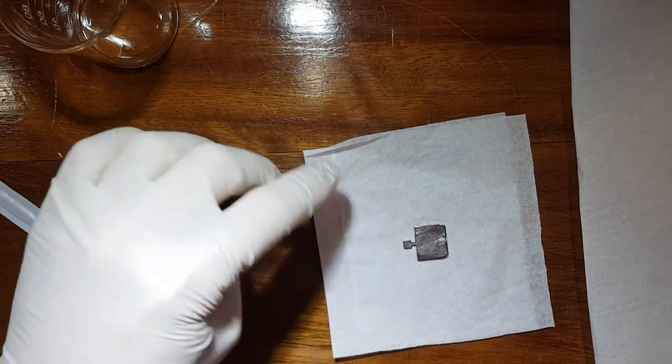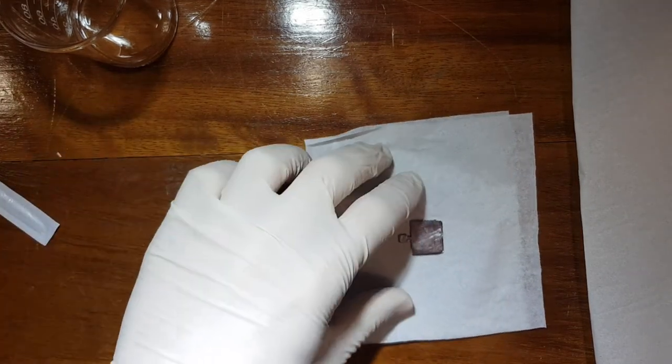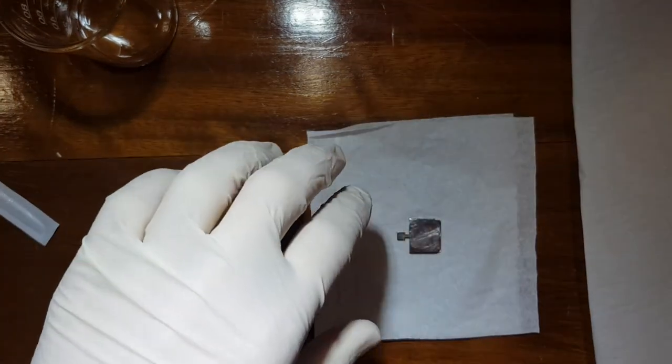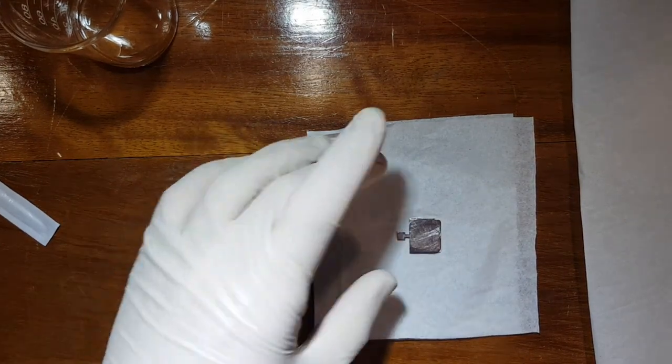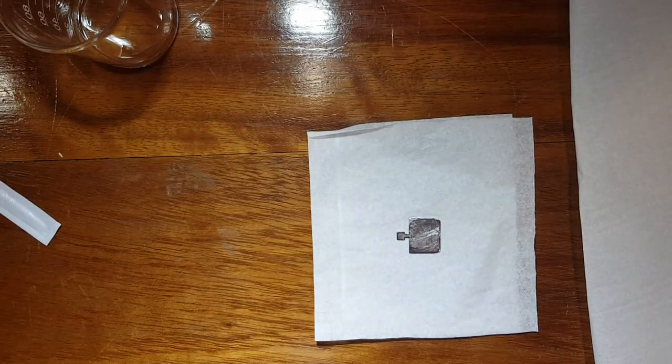You'll see that the moment you put it on the kim wipe, the kim wipe will actually go wet from the acetone. But as you blow it, it evaporates and the kim wipe looks dry again. By then you know it should be good to go into the sample storage. And that's it, it's really that simple.